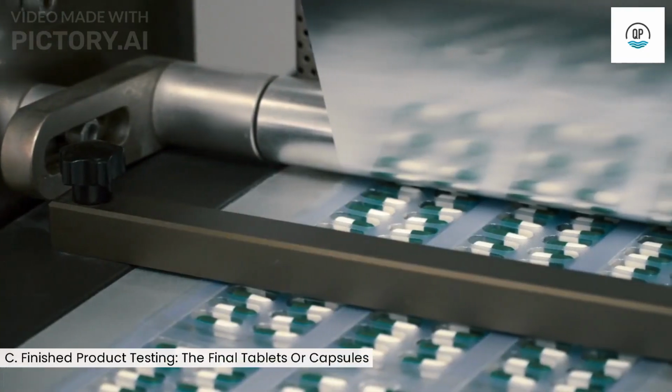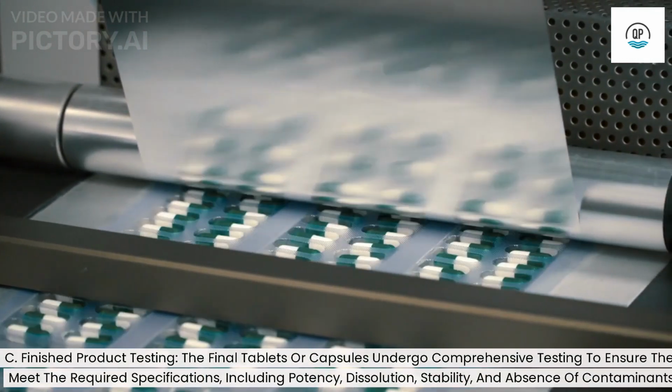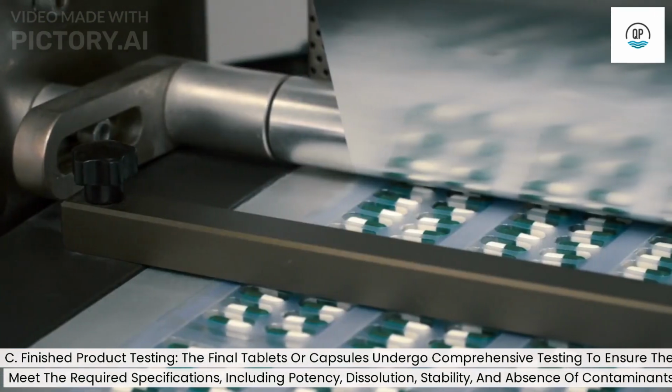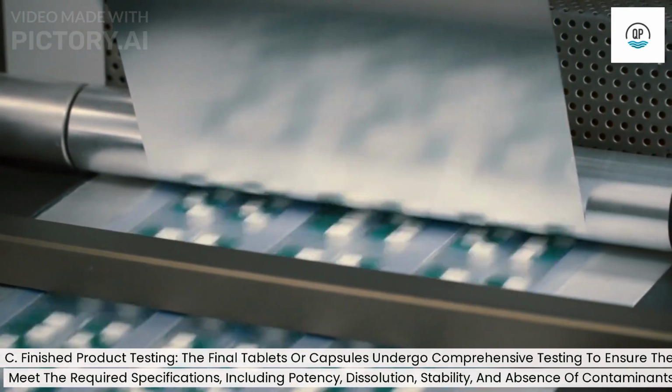C. Finished product testing. The final tablets or capsules undergo comprehensive testing to ensure they meet the required specifications, including potency, dissolution, stability, and absence of contaminants.